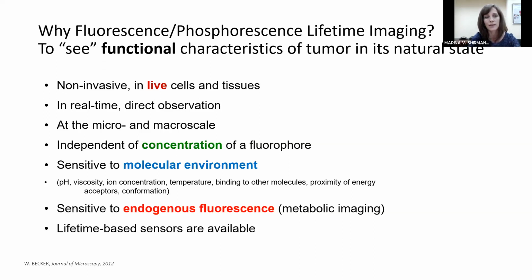Also, fluorescence lifetime is sensitive to the molecular environment of a fluorophore, and depending on the fluorophore, it can be such parameters as pH or other ion concentration, viscosity, temperature, conformation of the fluorophore, or binding to proteins. So many parameters can be measured if you use FLIM and have an appropriate sensor.